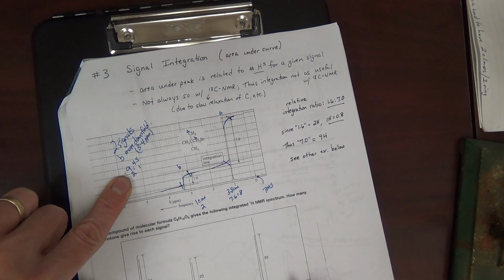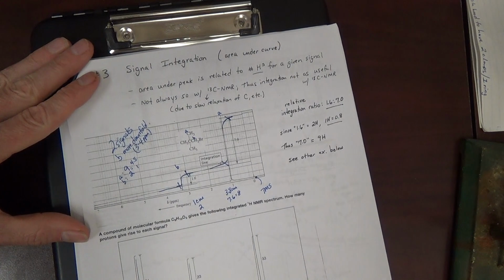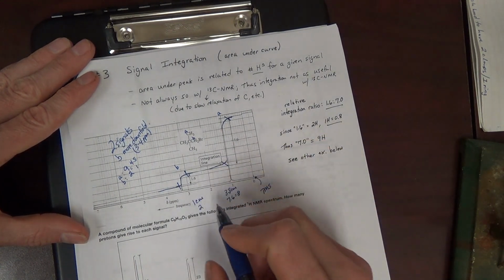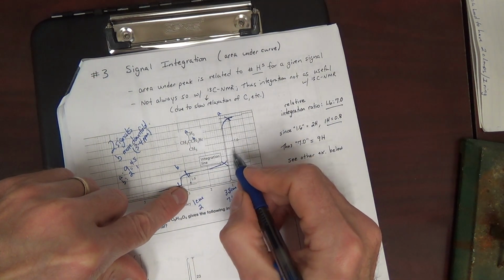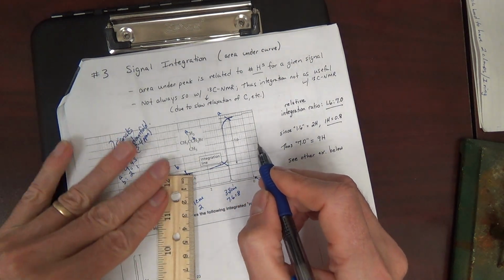All right. But let's also look at this. Some instruments will give you a computer-generated integration, and that's what we're seeing here. 1.6. I don't know what that is. That's not a centimeter.